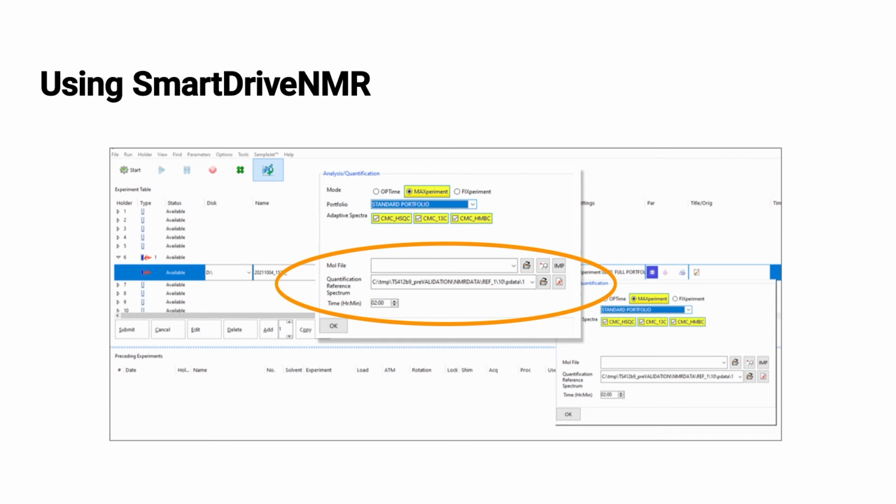So even if we take the big portfolio, the full portfolio, and keep everything selected with adaptive spectra by just providing, let's say, half an hour or so, one would also shrink the portfolio. Depending on how concentrated the sample is, the way the portfolio is evaluated goes further, of course, the more concentrated the sample is.